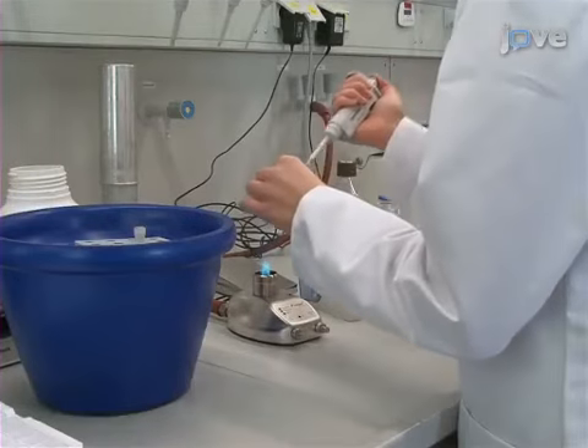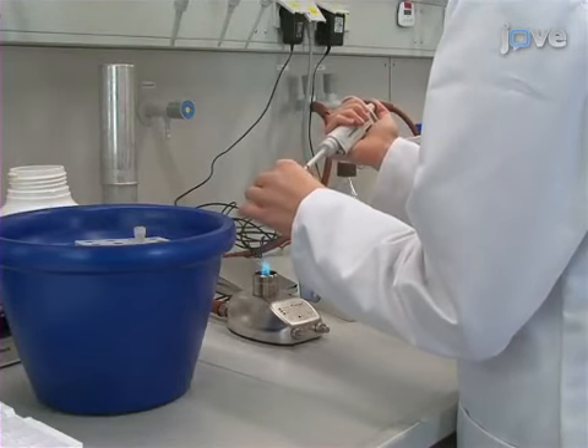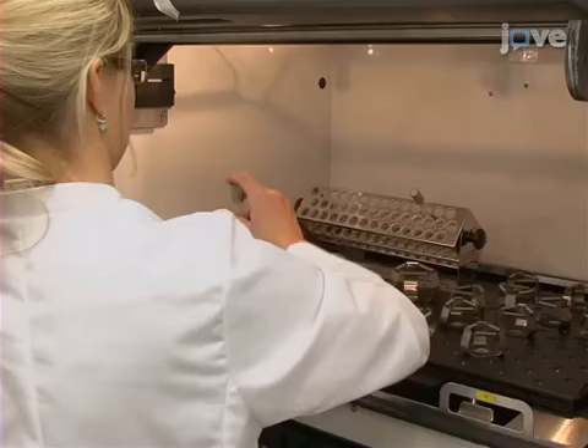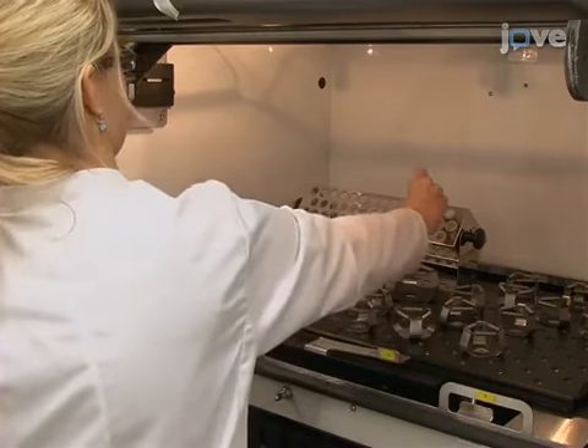Inoculate 4 milliliters of LB medium with 1 microliter of bacteria from minus 80 degrees Celsius cryostocks and grow the pre-cultures overnight at 28 degrees Celsius and 220 rpm.